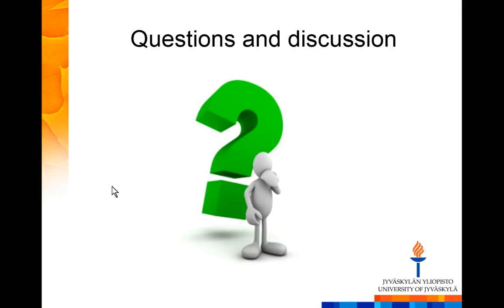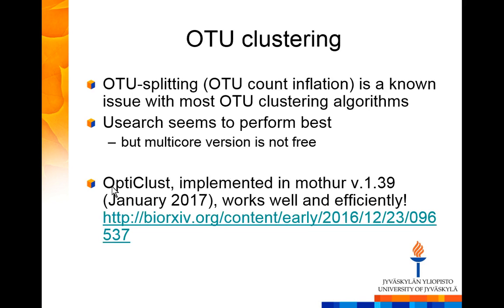For example, in that comparison or testing of OptiClust, you can also have in silico mock communities. You just take sequences and then insert some sequencing errors. And yeah, 8 is very little. I think usually people use maybe 10, 20. But in a typical natural community, how many taxa do you get compared to that?